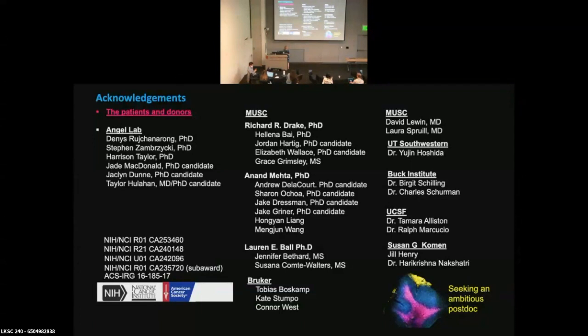You know, the other thing we could do is integrate lipids and enzyme imaging, and that's something that I think Aaron Seeley is working on. But I think right now we're at about 9, but it's really limited by how patient we are, because we have to remove the tissue to get a really good picture of the sequences that we're looking at.